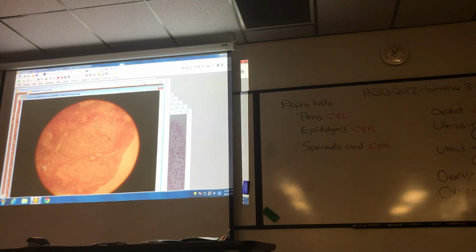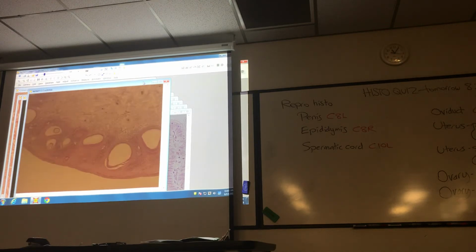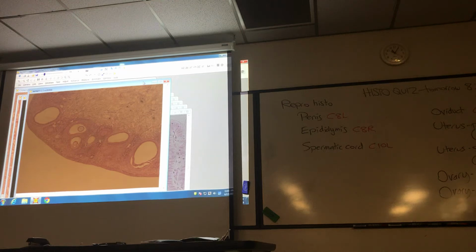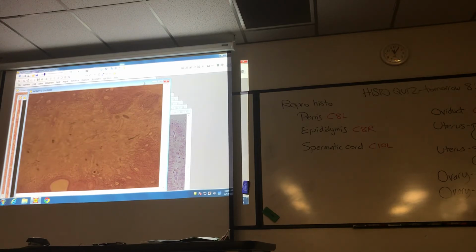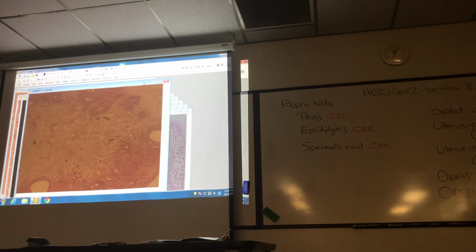Let's see here. All right, well, let's get into focus. All right, let me see if I can find it here. I'm going to go with another slide, like this one.